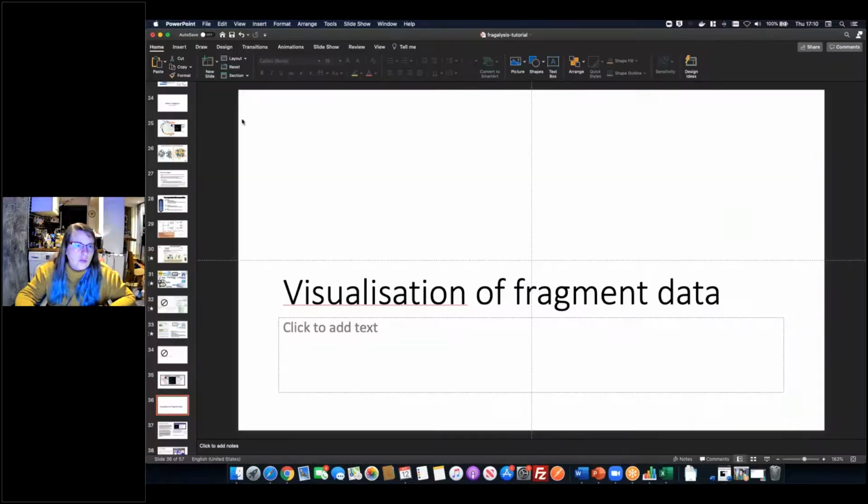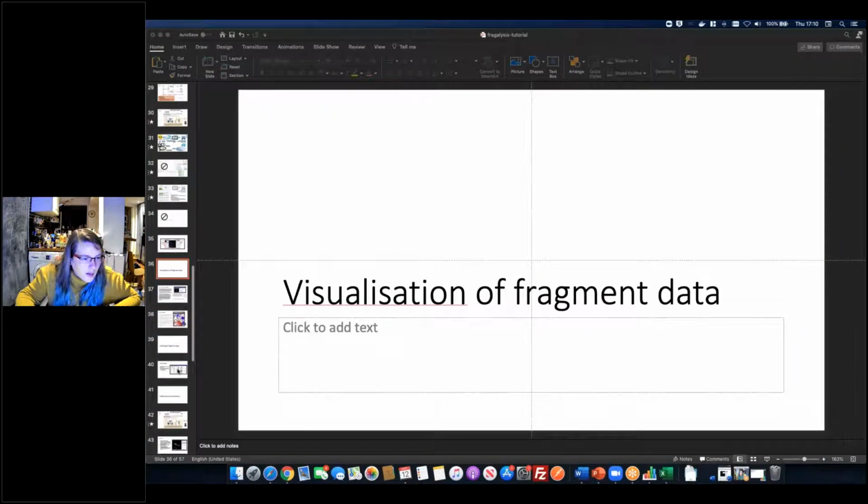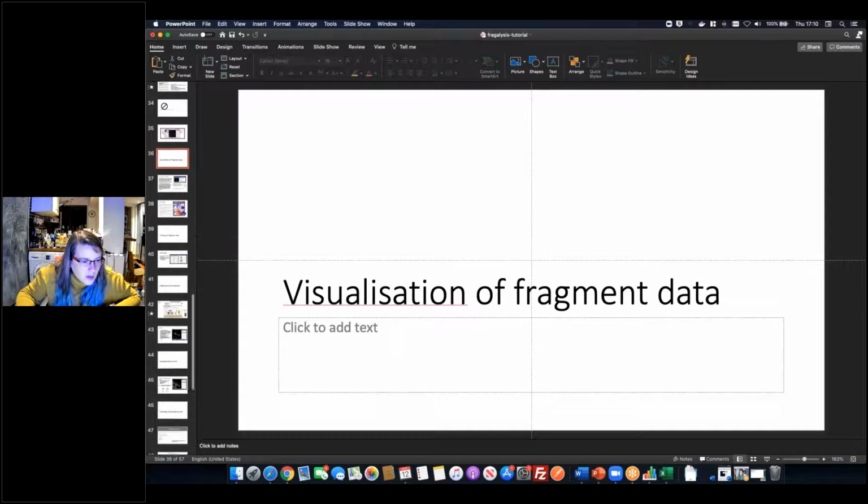So I'll show you quickly what that looks like. I was going to go through this in slides, but I think there's no need to.